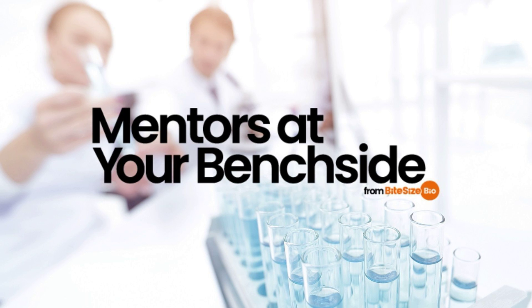In addition, this method measures non-protein nitrogen as well as nitrogen in proteins, so it may not give an accurate measure of true protein content, not to mention the use of some dodgy chemicals. And there we have it, the basics of 5 critical protein quantification assays.